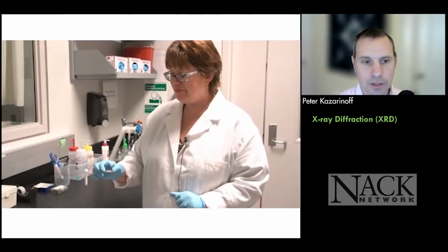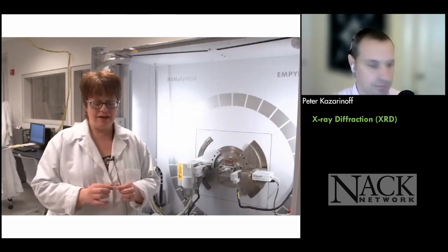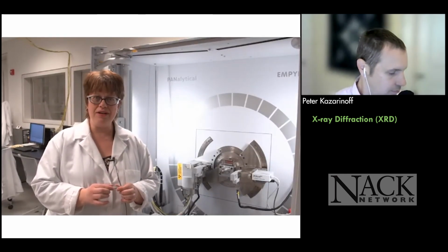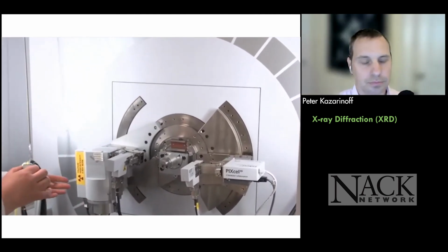So next, we're going to look at how do you actually mount a sample into an X-ray diffractometer. And again, this is going to be Nicole from Penn State. I'd like to show you now the way that we take the top-filled mount and mount it into the diffractometer. This is a fairly simple process.